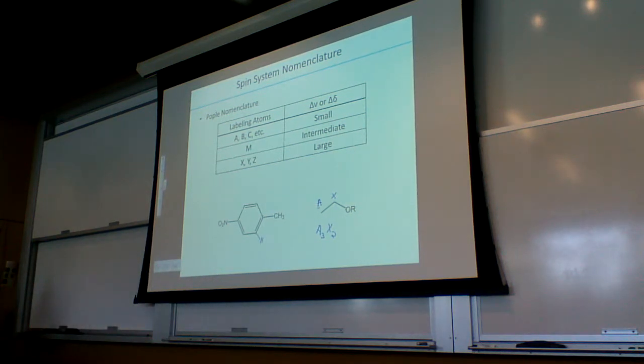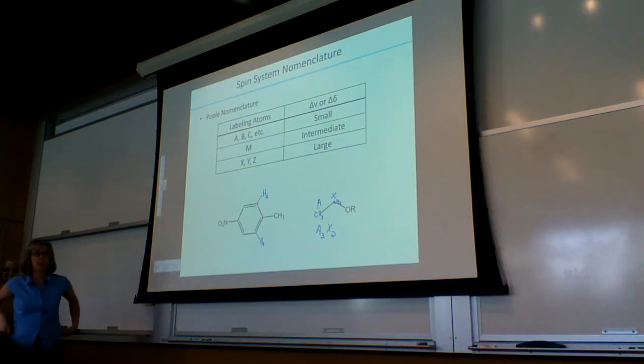Is this for H anymore? Yes. Why is it A3? Because there's 3 of them. CH3. Okay. CH2. And what is the delta nu or whatever? Same delta frequency or chemical shift. Oh. You know, they are proportional, or they have a relationship.